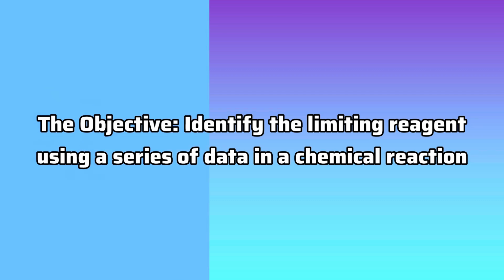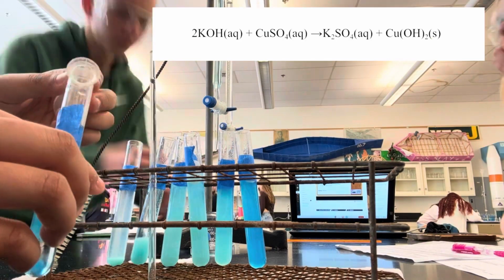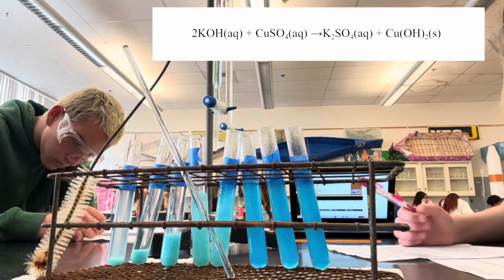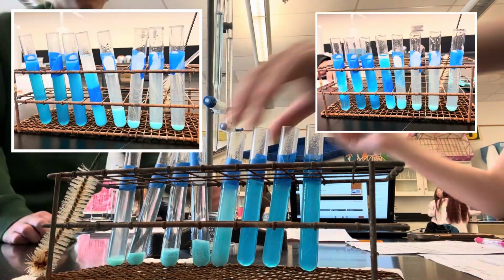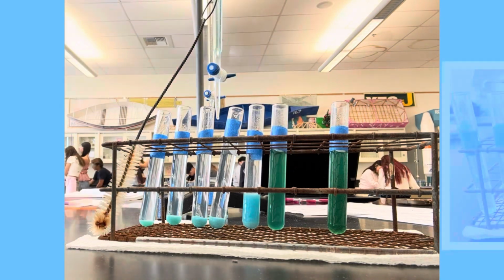The objective of the limiting reactant lab was to identify the limiting reagent using a series of data collected on the chemical reaction of two aqueous solutions, 0.2 molar potassium hydroxide solution and 0.1 molar copper(II) sulfate solution, to create copper(II) hydroxide and potassium sulfate. This is a double displacement reaction, meaning that reactants exchange ions to produce new compounds.